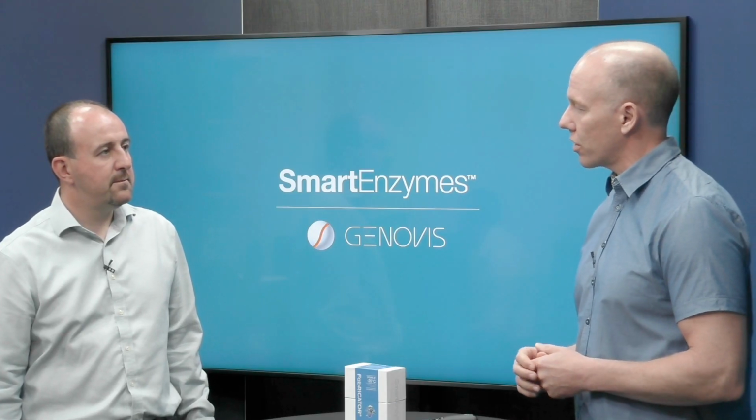There we would look at things like deamidation, oxidation, of course, which I showed, fragmentation, all types of chemical modification. Glycosylation is typically a part of the clone selection process, but also something we look for during lead selection to not end up with something that's completely out of the ordinary. Yeah. Okay, that's great. Interesting to hear.